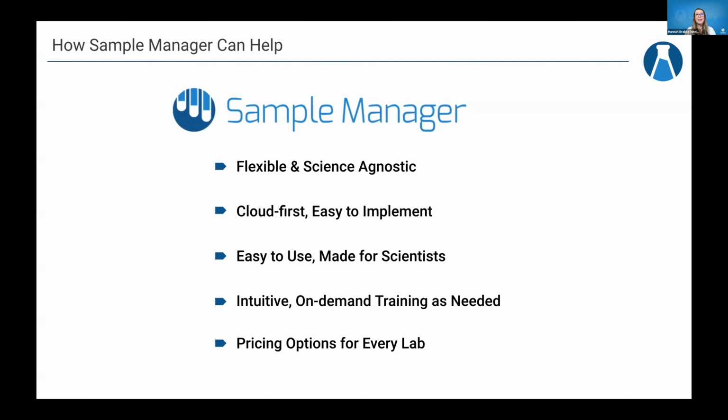And if implementation seems too insurmountable, which again, I totally understand, Sample Manager is a cloud-first option. And so this really is removing the need for any in-house IT support. And so that's one implementation barrier gone.